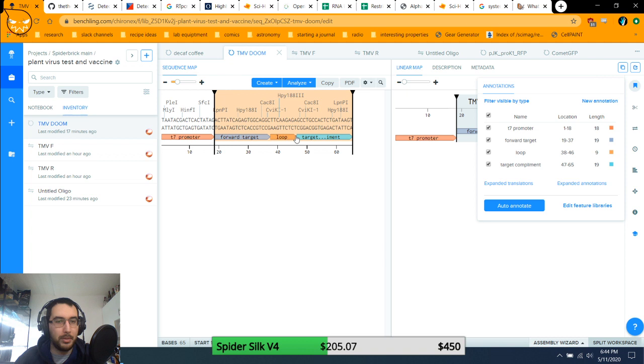The actual RNA letters. I can't buy them right now. I mean, I can, but it's going to be really slow, and they're expensive. Normally I've got tubes and tubes of dNTPs, which are the individual letters for doing DNA synthesis, but what I do not have are NTPs, which are all the letters for doing RNA synthesis.